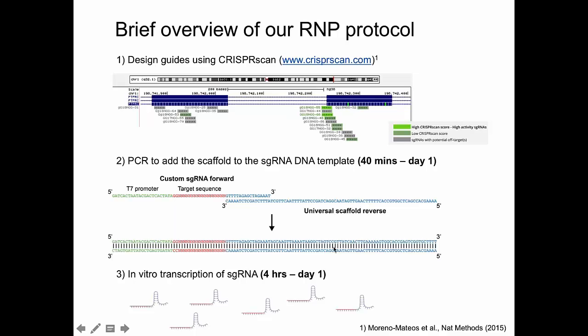And the in vitro transcription, again, you can do almost directly after the PCR, and it takes about 4 hours. You can run it overnight if you want, if you're trying to save some time.